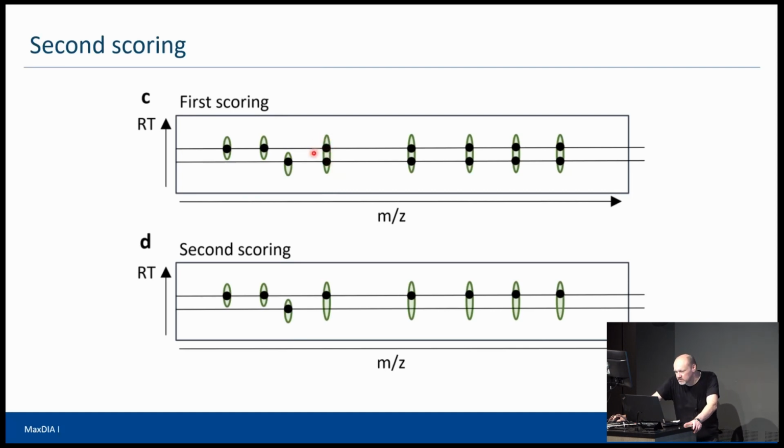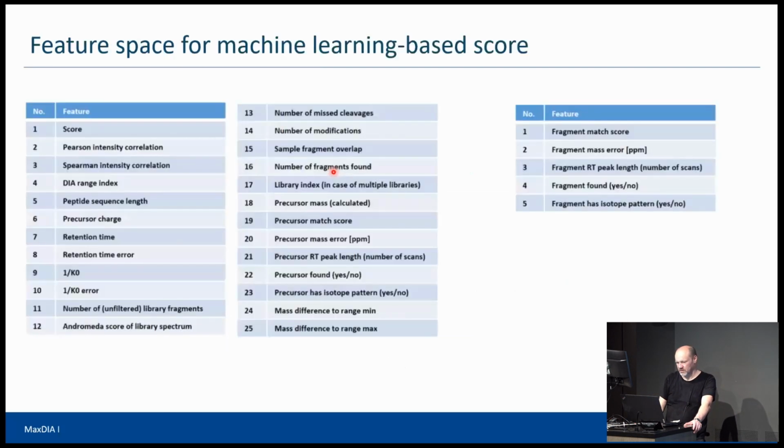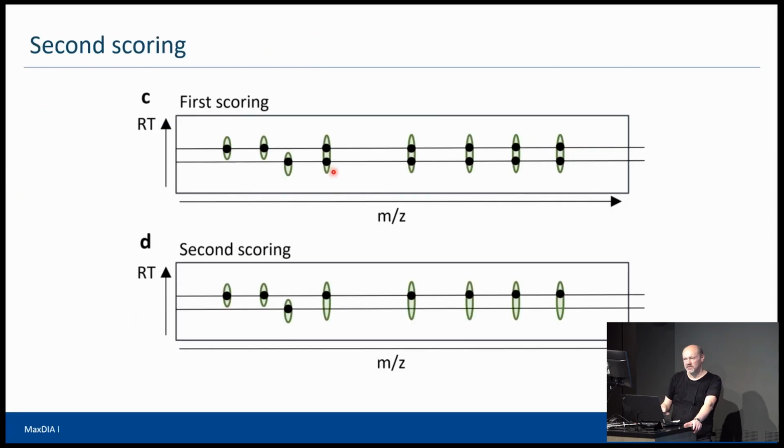For that, you need to detect these peaks in high dimensional ways, basically, right? So that puts us in the position that we can enforce this. If you don't determine the peaks like that, then you also cannot enforce this kind of rule on your data. Okay, so that's the raw scoring.